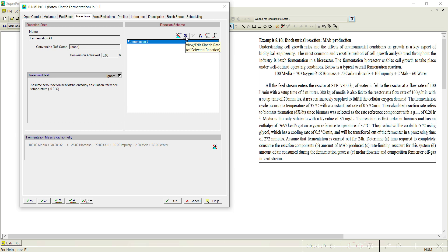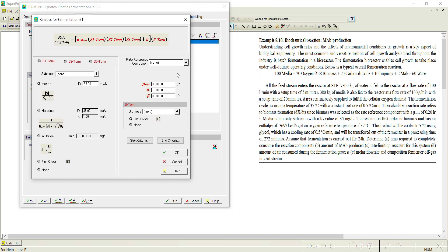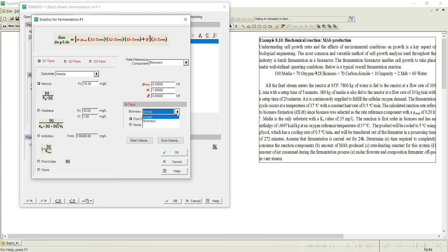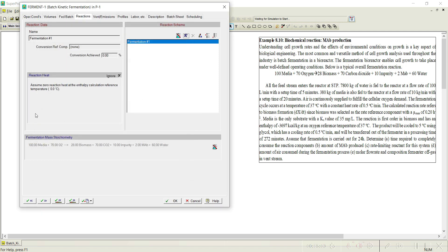Now let us add the kinetic information. In stoichiometric mode we add percentage conversion and reaction heat, but in kinetic mode we add kinetic parameters. The reference component is biomass — as biomass concentration increases, MAB also increases. The specific growth rate (μmax) is given as 0.2 per hour, Ks is 35, the substrate is media, and we go with the Monod model. Biomass is the biomass term. We set all the parameters and click OK.